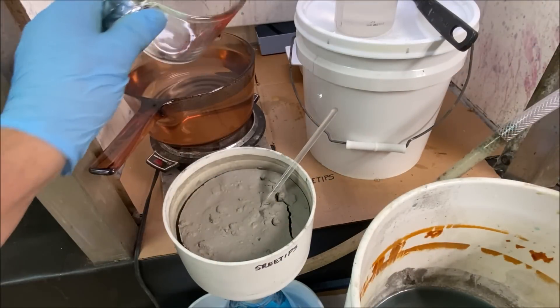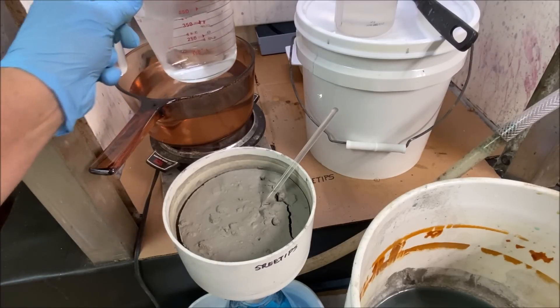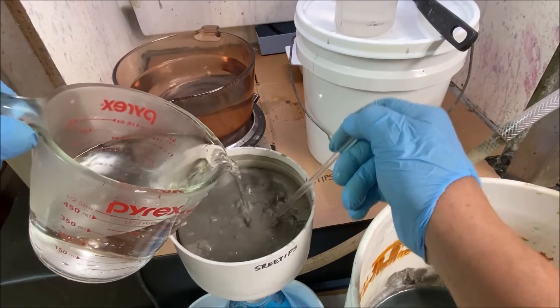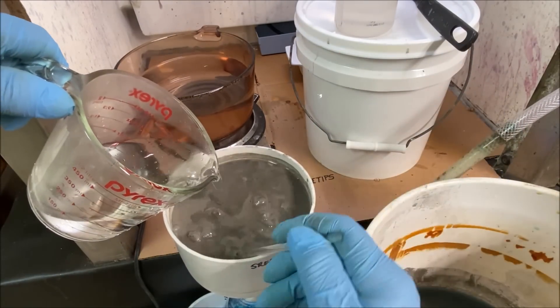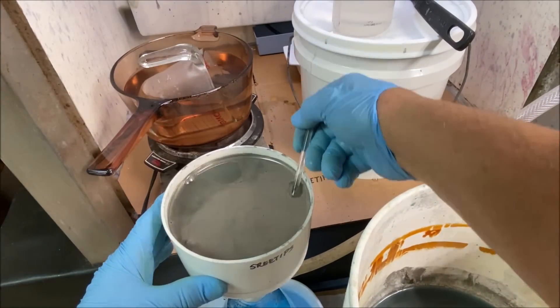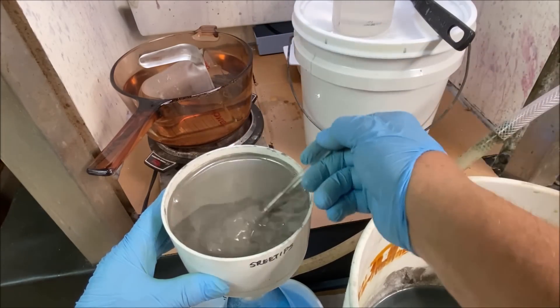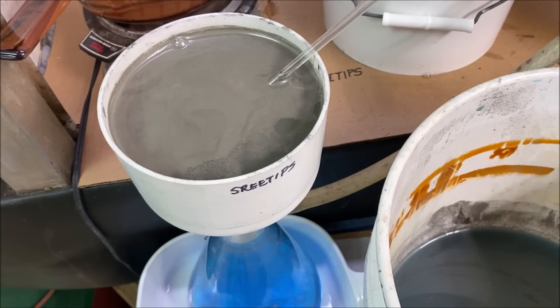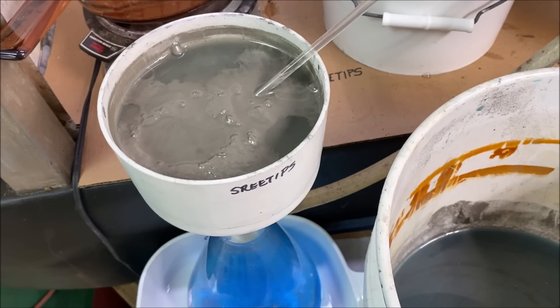I've got some distilled water heating up over here. Now we're going to use hot distilled water to rinse the silver.